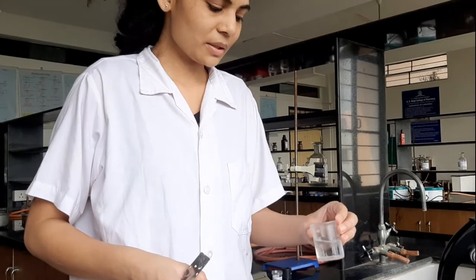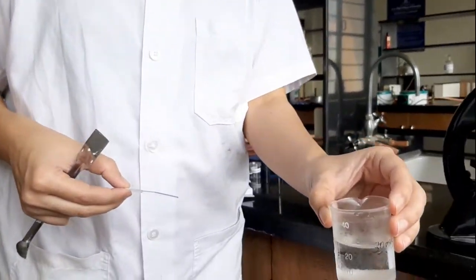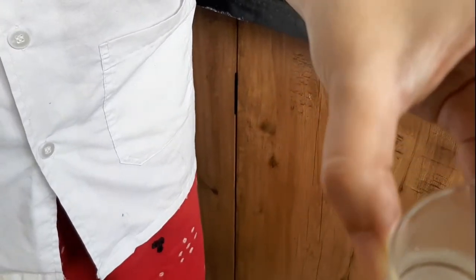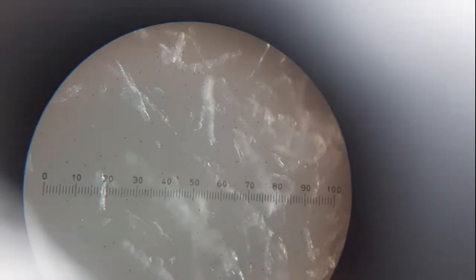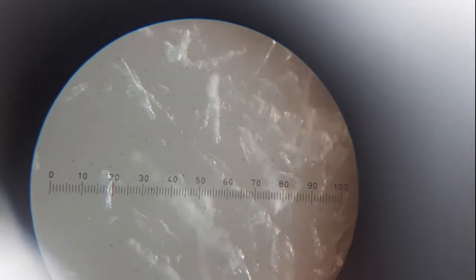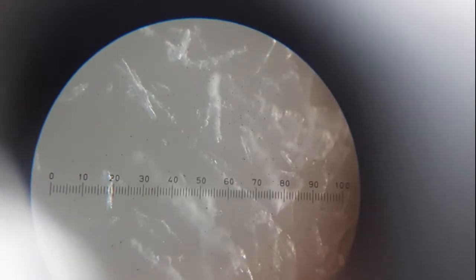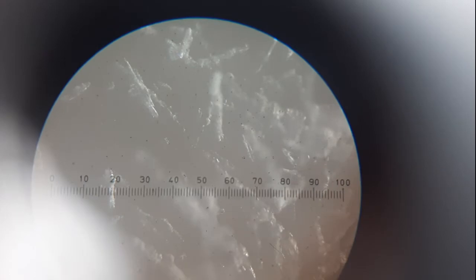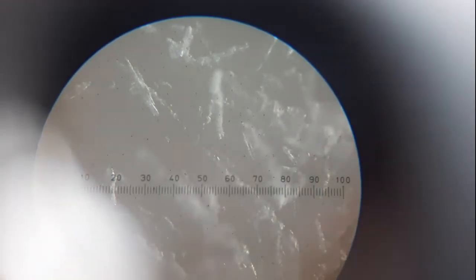Now this is our 30-minute sample, and if you observe, the crystals are very well formed. These are the crystals formed at 30 minutes. The average size of these crystals is 36 units of the eyepiece. Now we will proceed to the 40-minute sample.